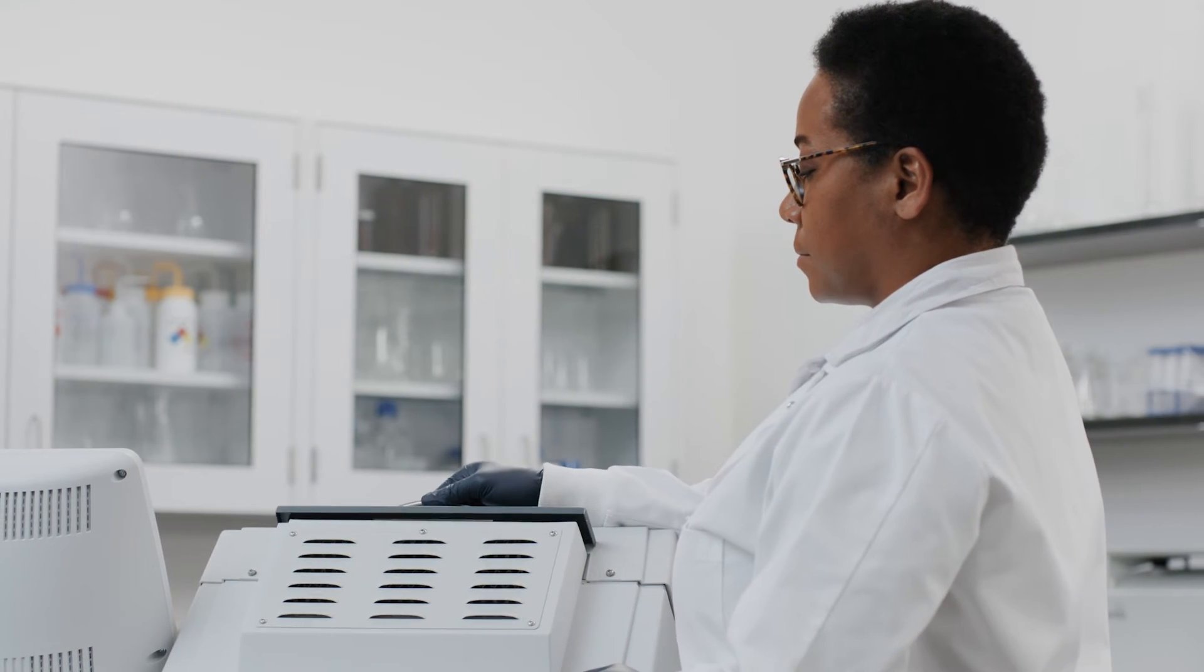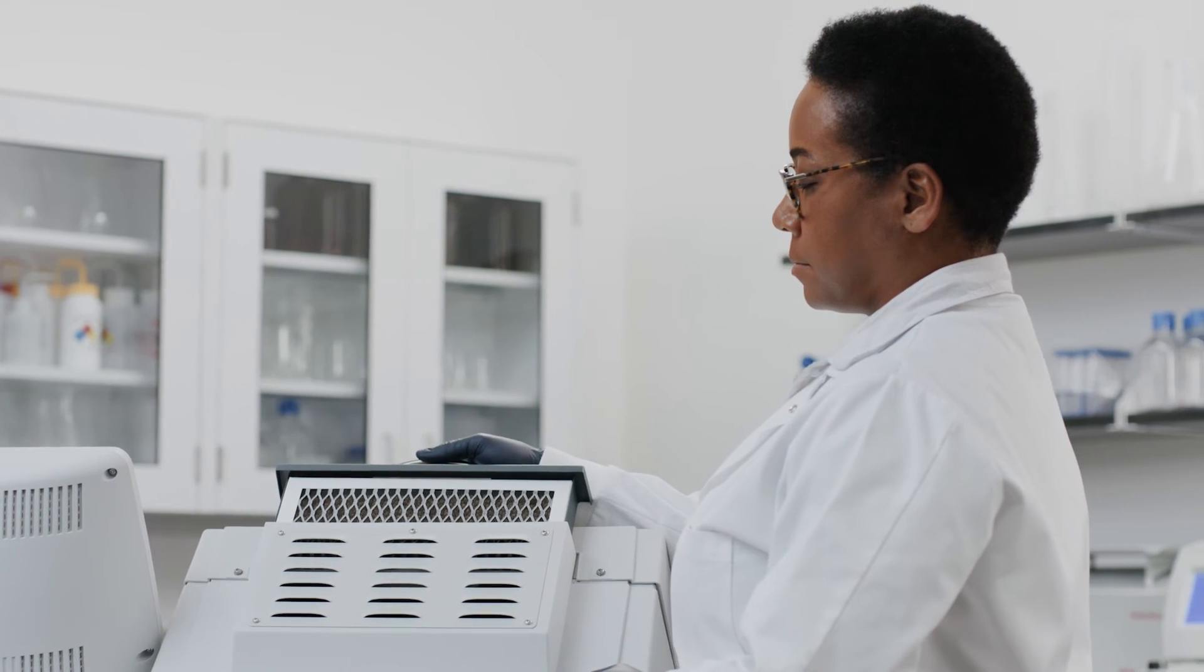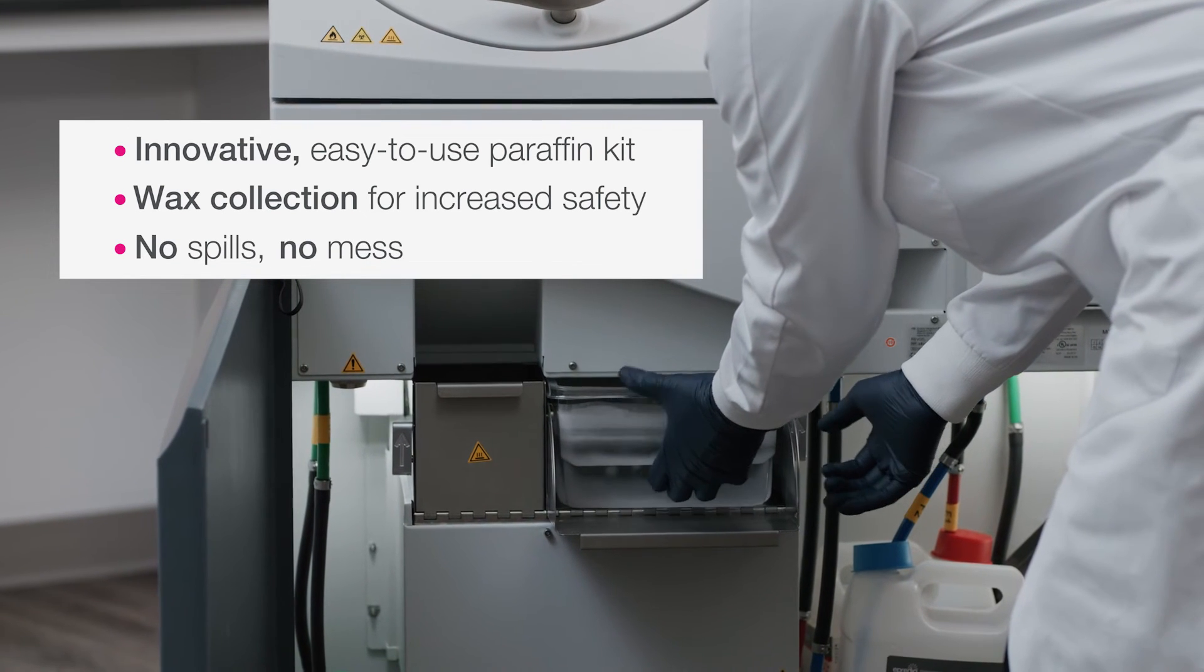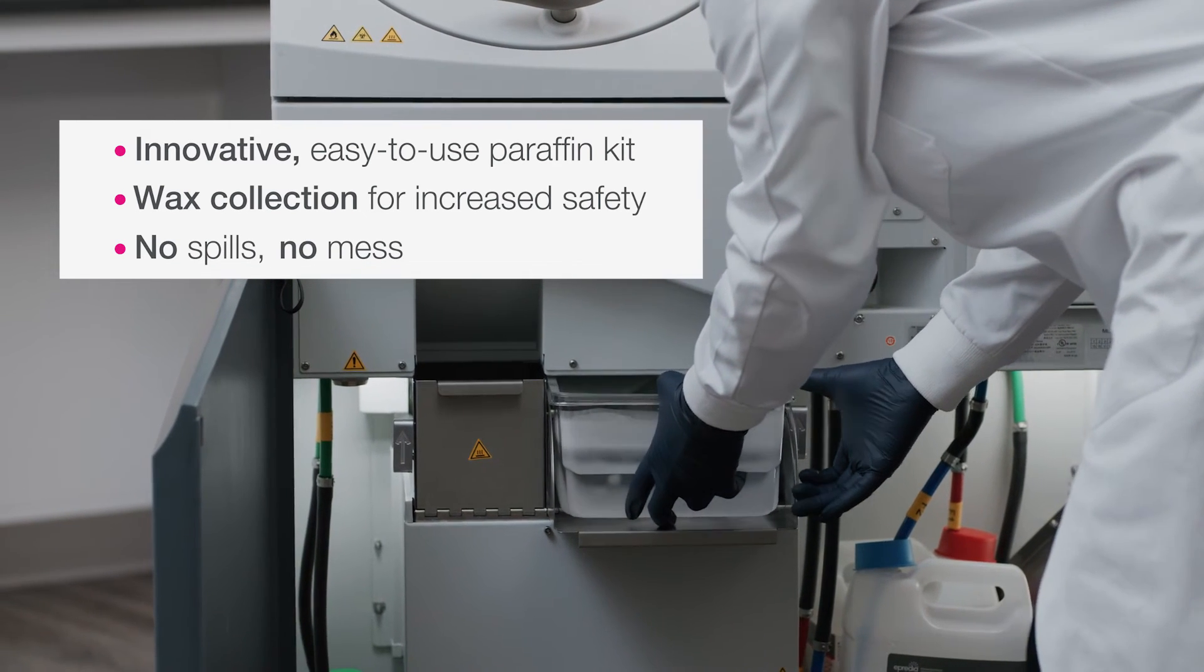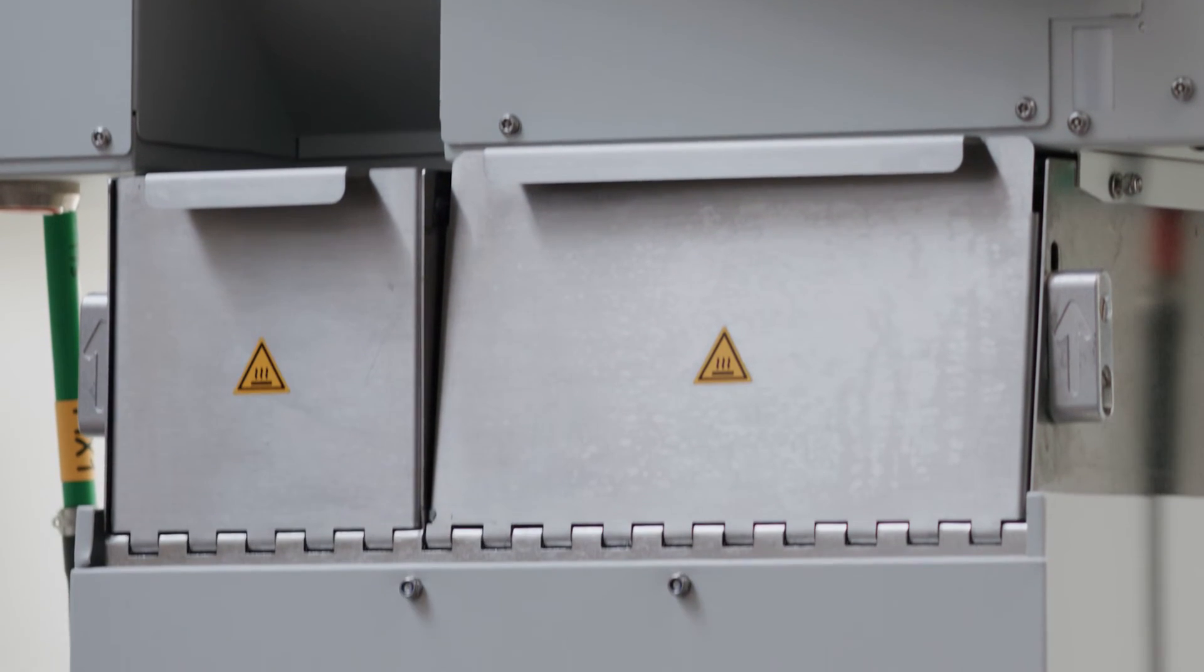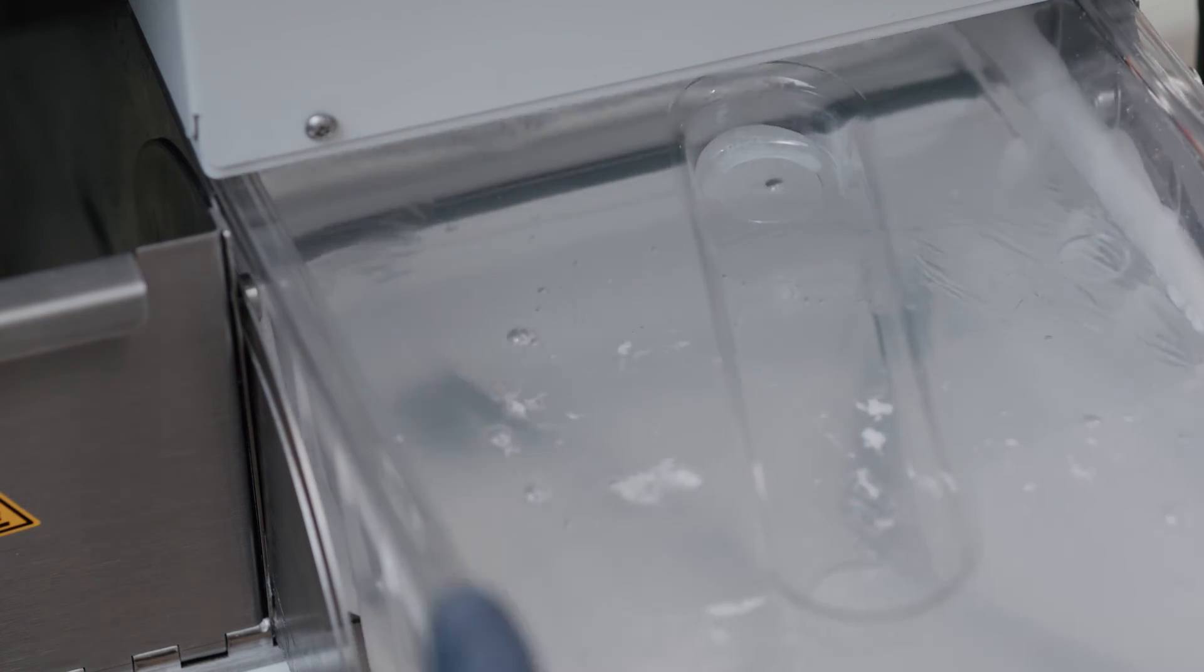Apredia disposable single-use wax waste drawers help you avoid spills and create a safer lab environment. Hot wax is automatically transferred and collected, protecting your staff from burns. Simply remove and discard each drawer.